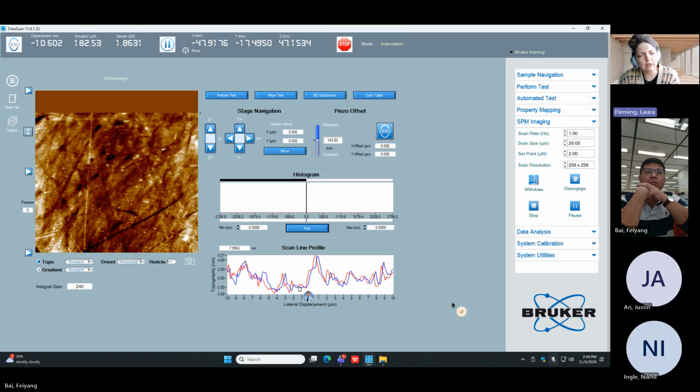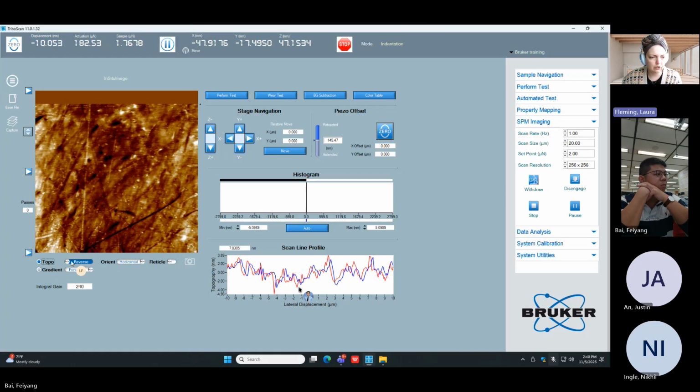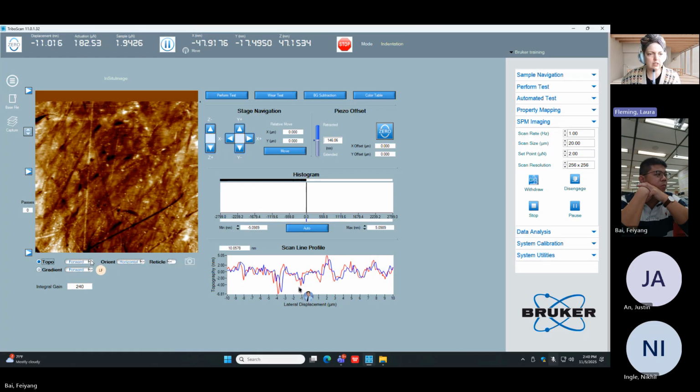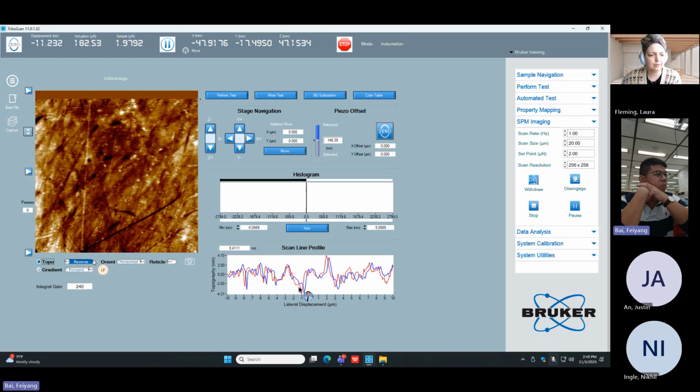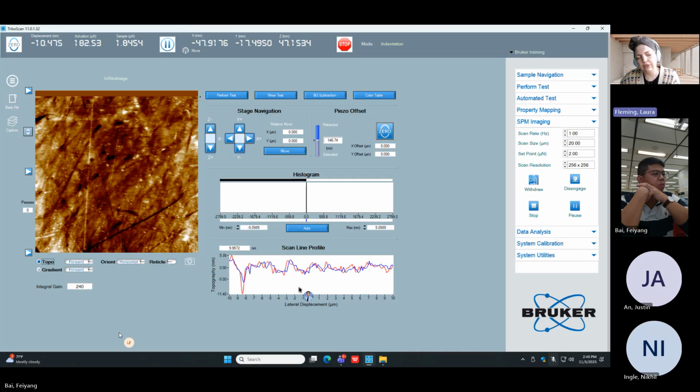The longer we wait, it might get slightly better, but it is expected because this is an open loop piezo. Keep in mind, we're not an AFM. But you can actually see the difference. Here you get 6 images out of this, topographical, forward or reverse. So you can actually see the hysteresis and how the image shifts. It's expected behavior of the piezo is how I would put it.